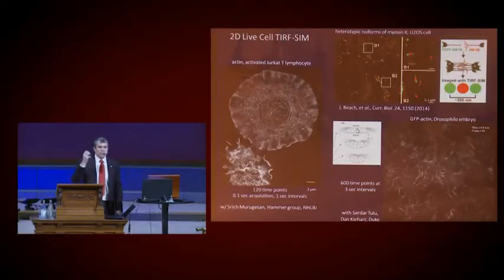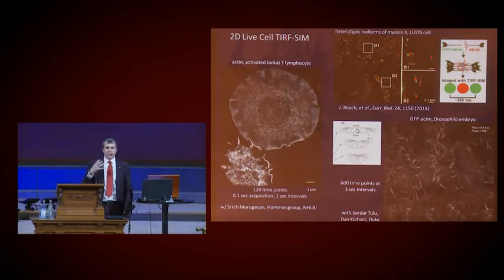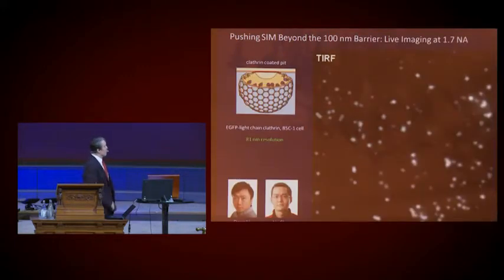So here we plop down a whole Drosophila embryo, and you're looking at these amnioserosa cells in early development, and you can see the single actin filaments going through these pulsating contraction expansion phases of positive feedback oscillations that drive these wave-like motions of those cells.